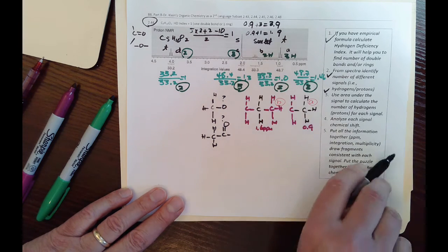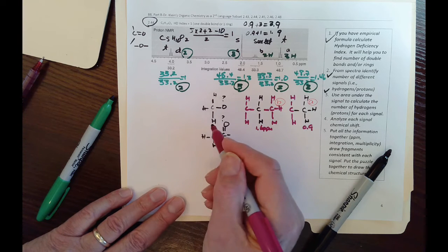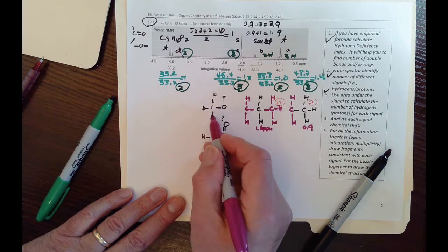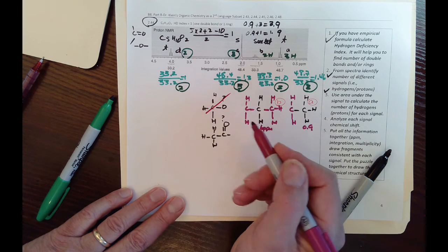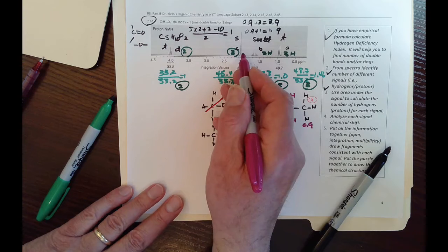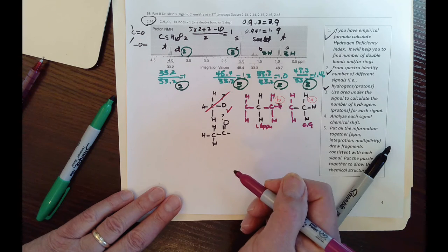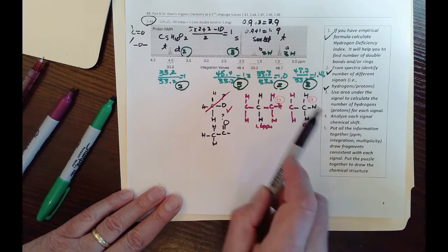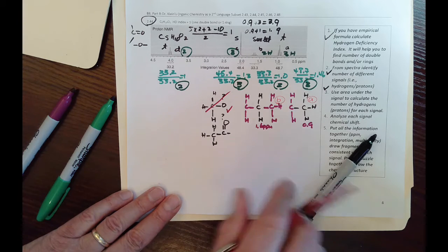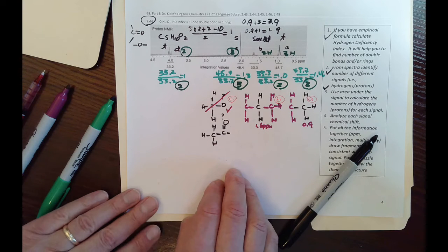So we can say that just by the ppm and knowing the change in ppm, the CH3O probably is not representative of this signal here. Most likely it would be C double bond O based on the ppm. So we did A, we did B, we figured out what the C should be. We have a good guess for that.